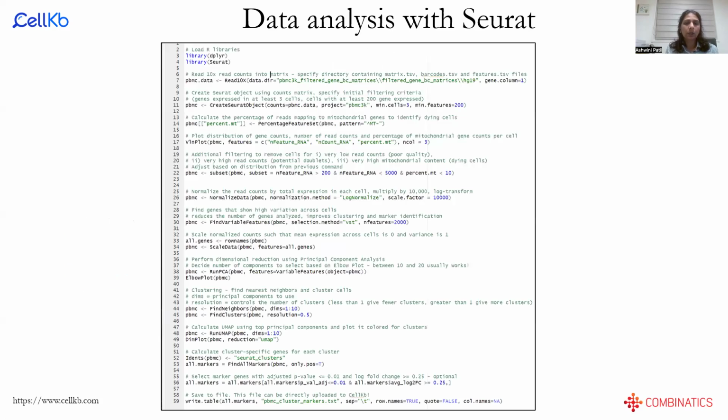Okay, so this is the code for Seurat. And the reason I'm showing this is because I want to set up the creation of cluster-specific gene lists. This is one of the ways that you can generate cluster-specific gene lists for annotation. These commands are taken exactly from the Seurat tutorials on their website, so you can copy them, and these slides will also be shared along with the comments over here. So you can copy it from here as well.